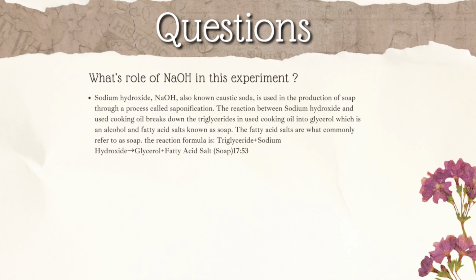The reaction formula is: when triglyceride combines with sodium hydroxide, it will produce glycerol and fatty acid salt, which is called soap.